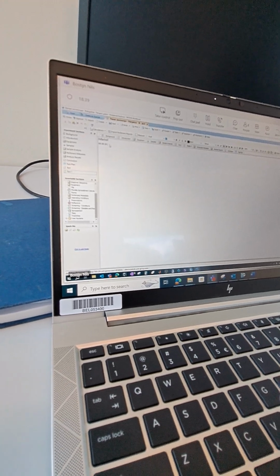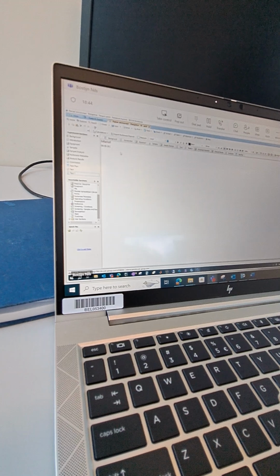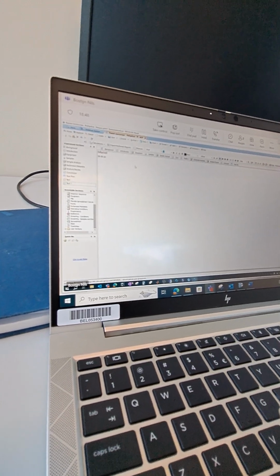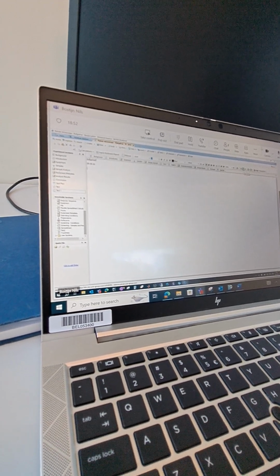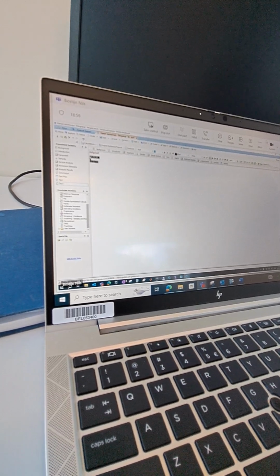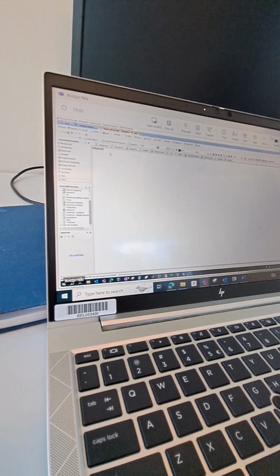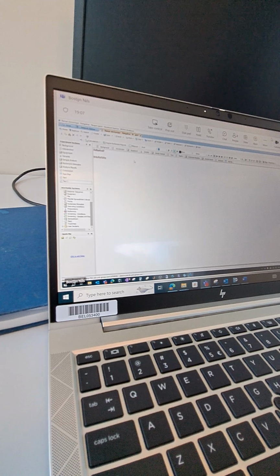For example, if you would like to keep track of what you're doing, you can fill it per day. On this day I did this. On the next day I did this, and so on. Fine. You can even do it more detailed if you want. You can even select here, and then you have the time. And for the rest, it's really like a Word section, and you can put it in bold. You can underline it.